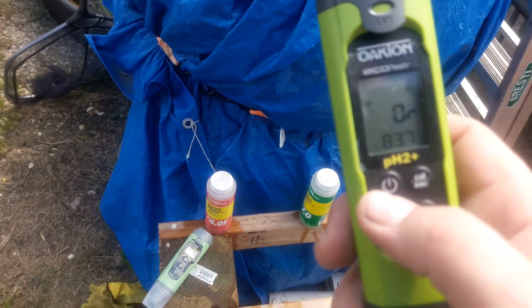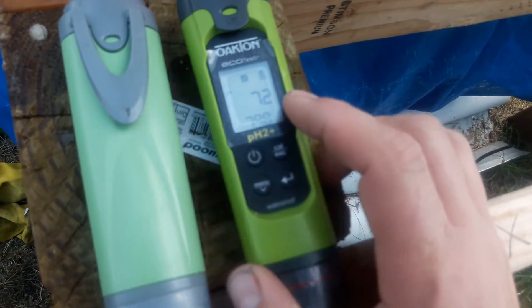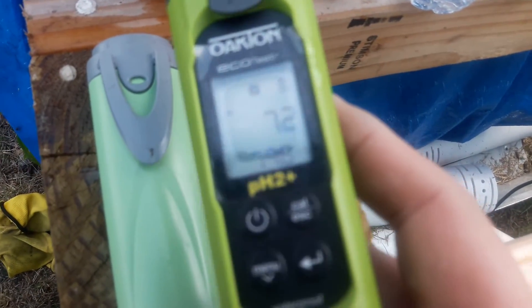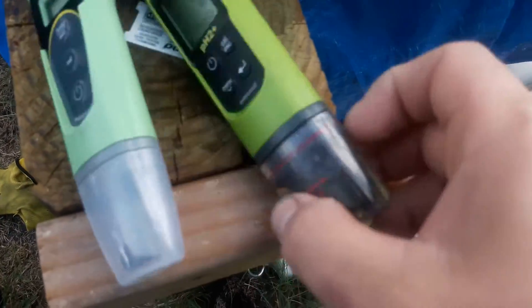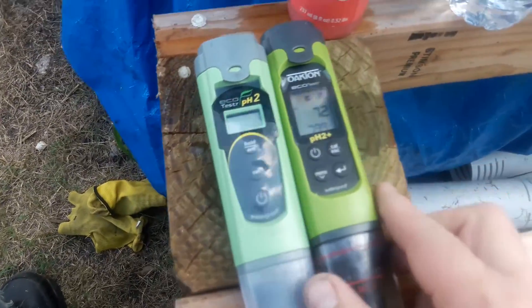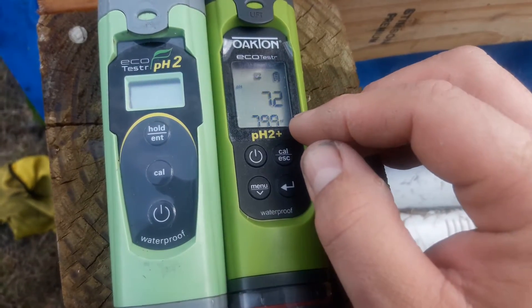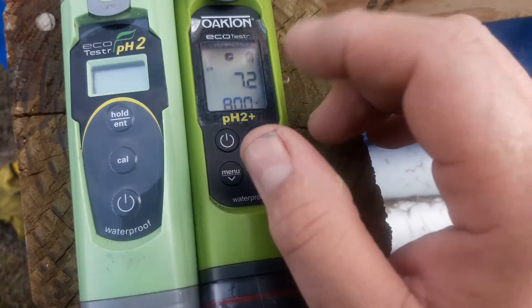When done, push the battery cap back on. The only drawback we found compared to the old model is that the old one had a clip that could attach to your overalls, pants, or shirt. Other than that, we love the new one because it has the temperature gauge built in, eliminating one tool from our kit. It's waterproof, has the max fill line, and three-point calibration is just one push of the button — instantly calibrates to 4, 7, or 10.